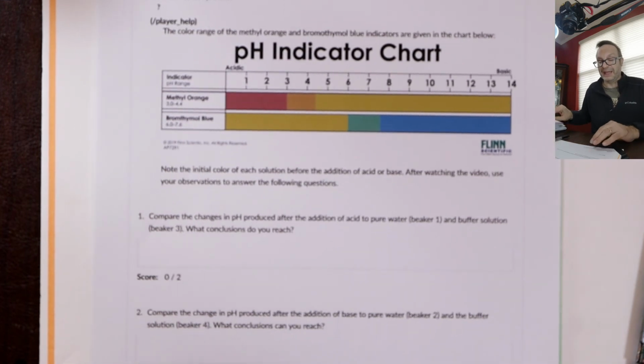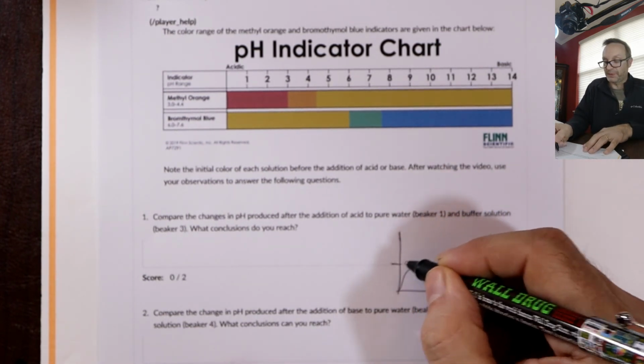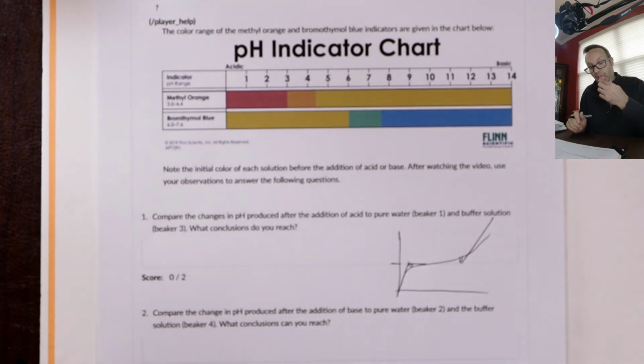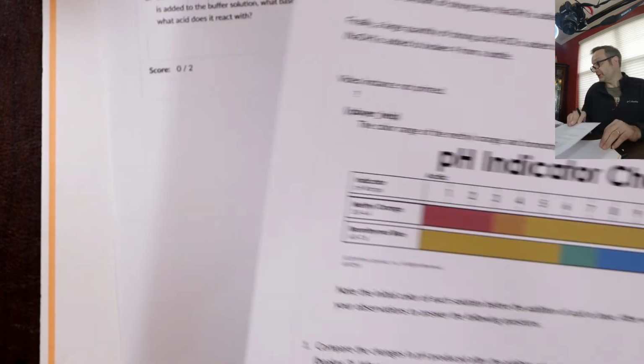And then you're going to just add acids and bases and see what the pH is. Remember, you shouldn't see much of a pH change. The pH curve looks like that, so the pH stays pretty stable over the buffered region. And when you get past the buffered region, it's going to drop or go up quickly. So you can look at the buffering capacity: how far can you go before a big change? That's pretty much it.